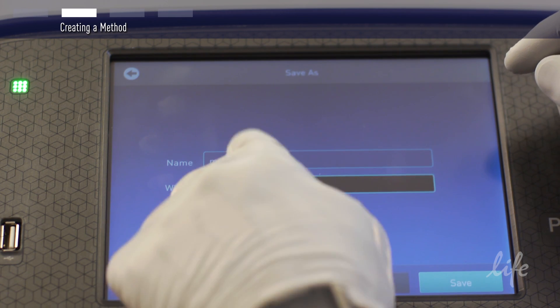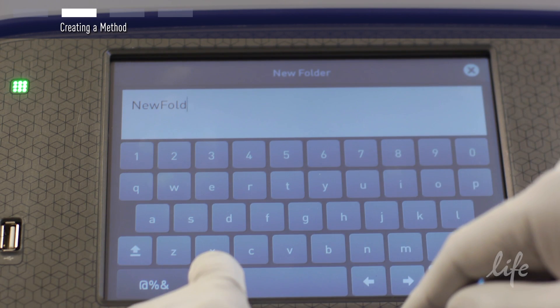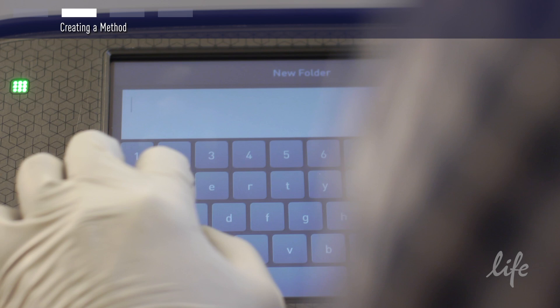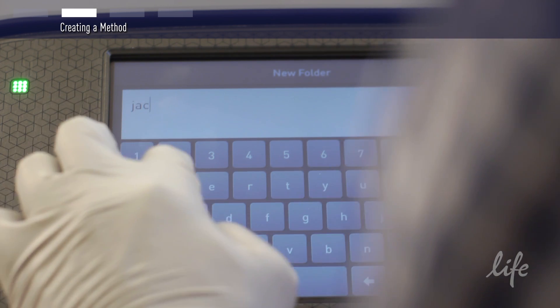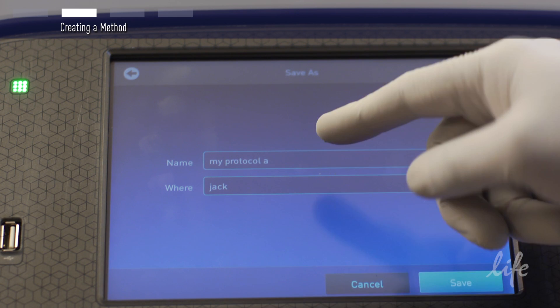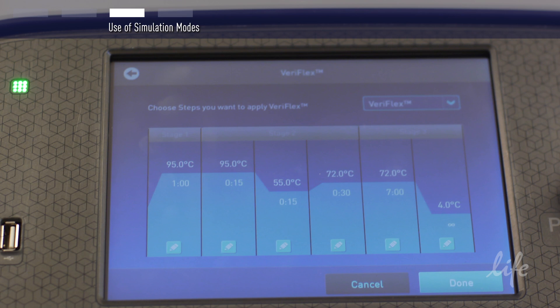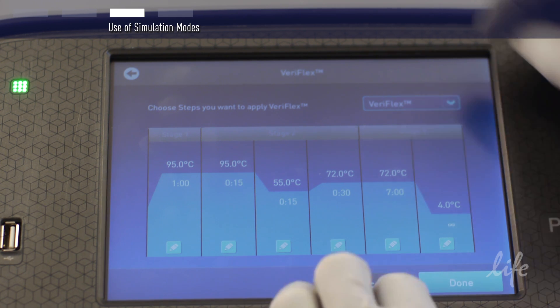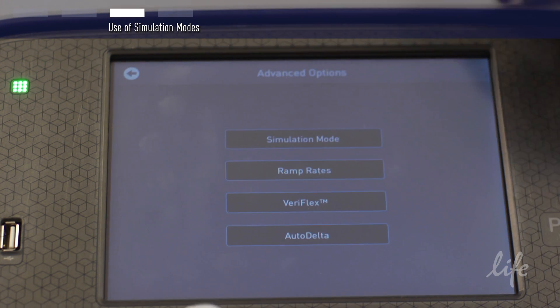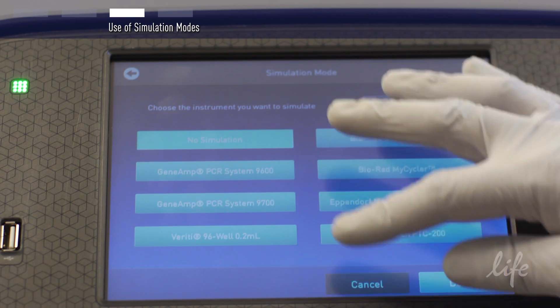If you would like, you can save the protocol in your personal folder for future use. In addition, you can program ProFlex to simulate the ramp rate of an old instrument. From the advanced options menu, press simulation modes and select the instrument you are interested in simulating.